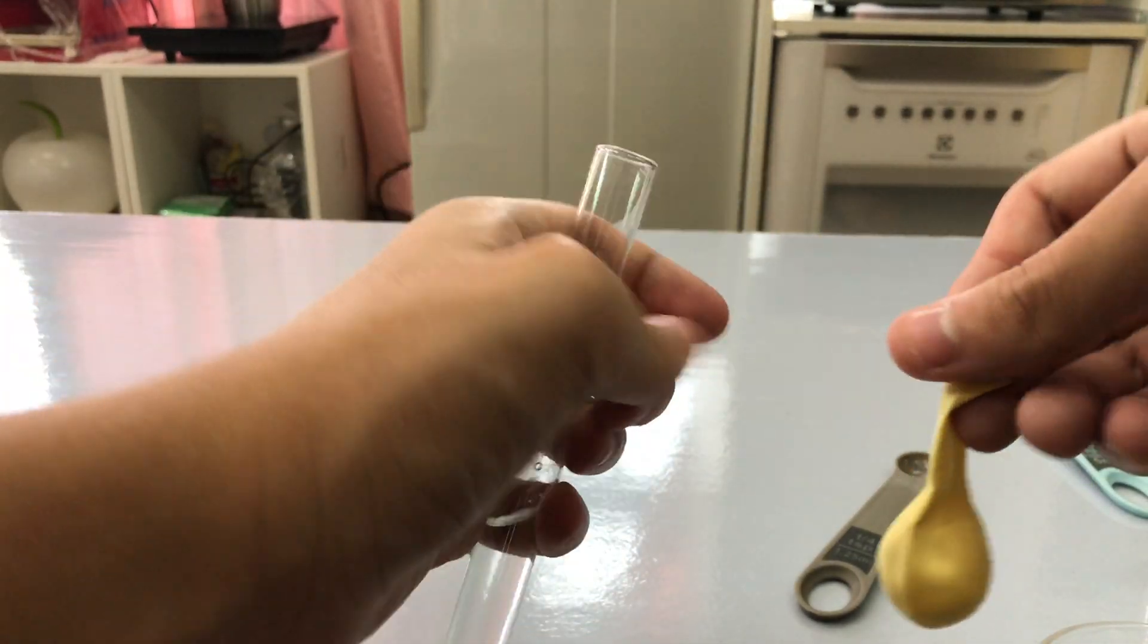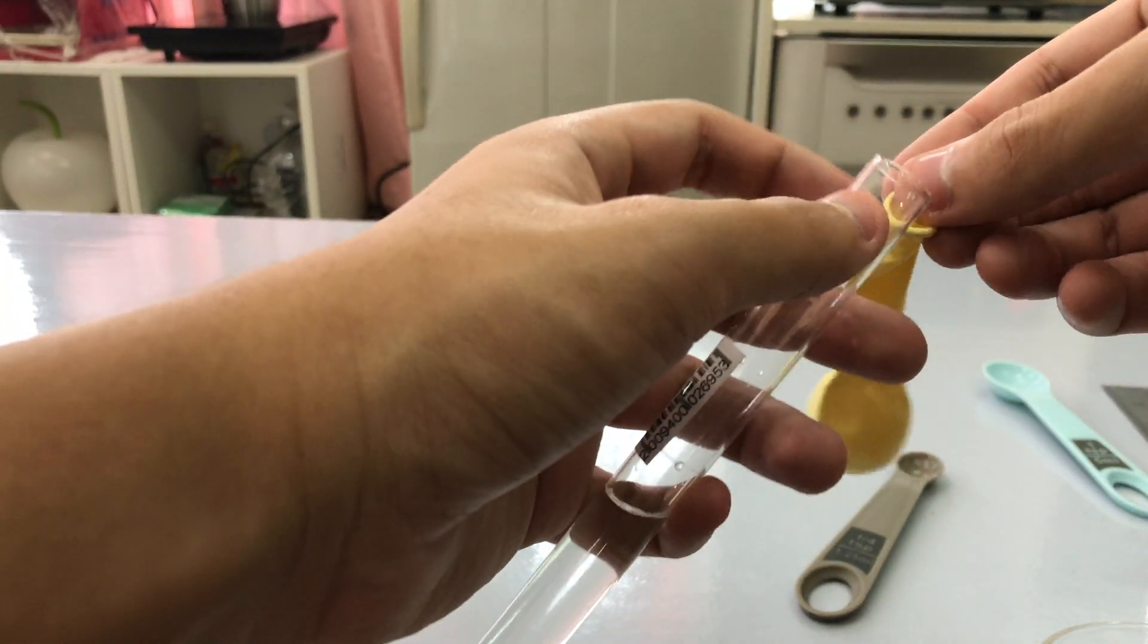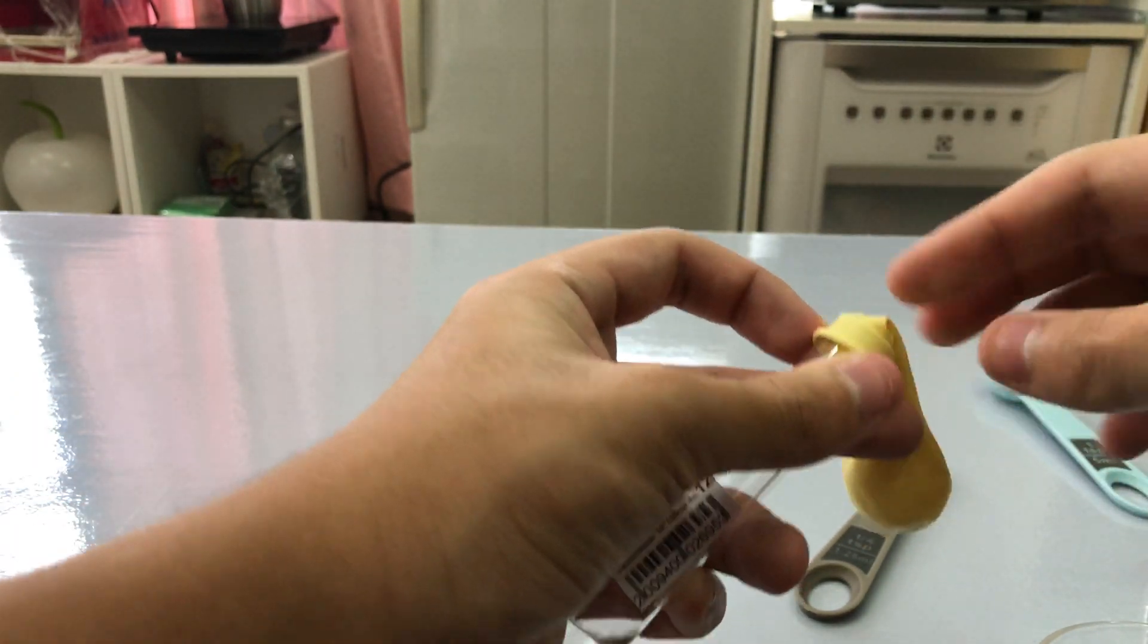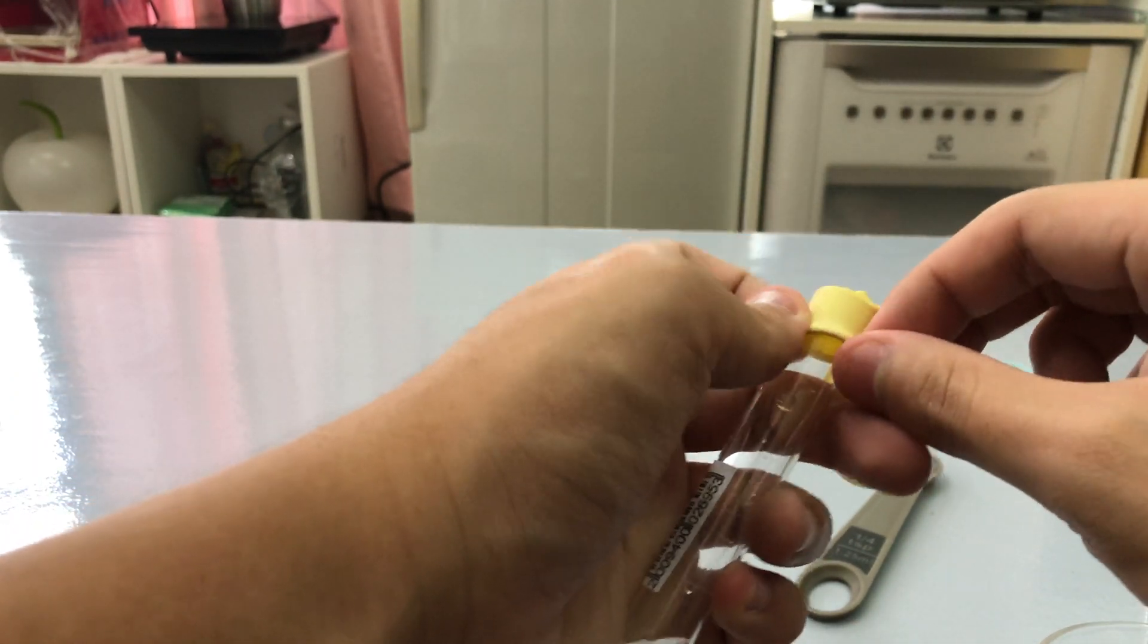Next step, we use the balloon that already has the sodium bicarbonate inside and make sure that the sodium bicarbonate does not flow inside the test tube.